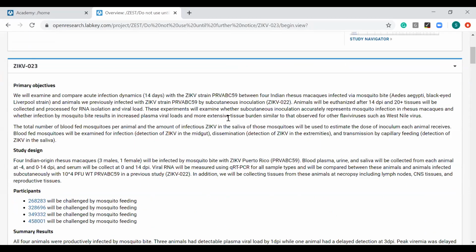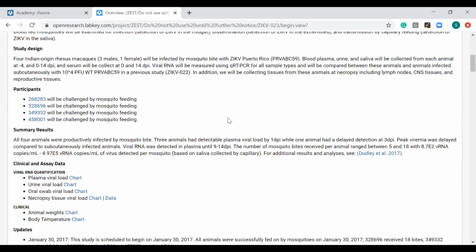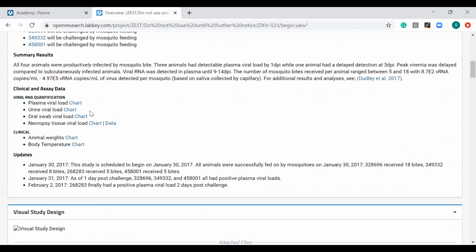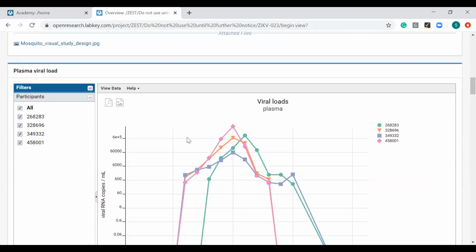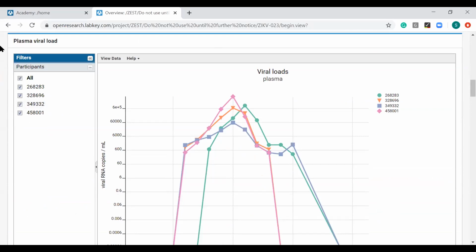They've added this text to this text panel to give us a sense of what they're doing. They've added these links to highlight the main parts of their research, the main results of their research, etc. Notice this visualization panel. This is a chart panel or web part. And one of the things that's also notable about LabKey is how much control it offers the end user.